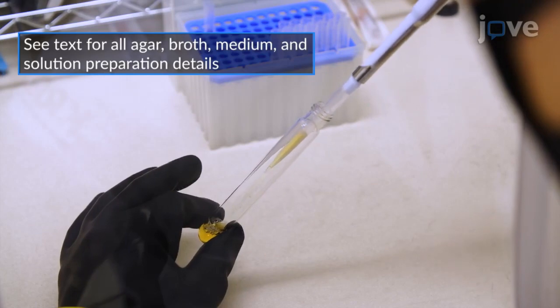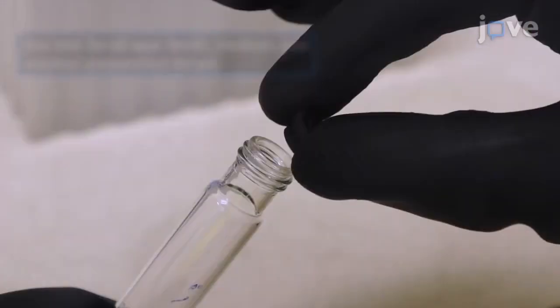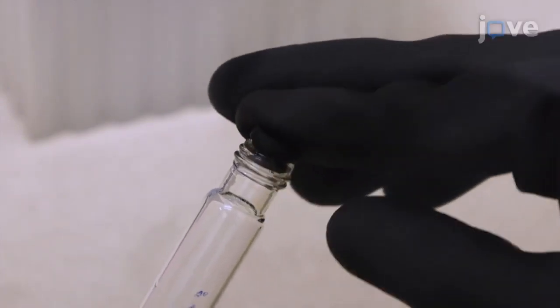Add 2 to 3 milliliters of MRS broth supplemented with L-cysteine to the tube and seal the tube with a butyl rubber stopper and tube cap.